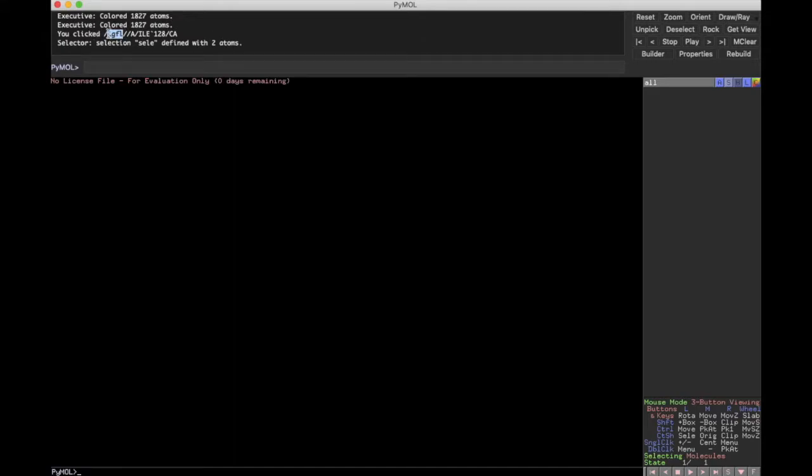And so whenever a molecule is submitted, PDB assigns a 4-letter alphanumeric code that is permanently attached to that molecule. This is kind of like a barcode, where if you put in that code, any software will open up that particular file.